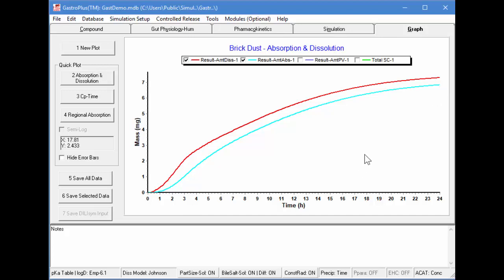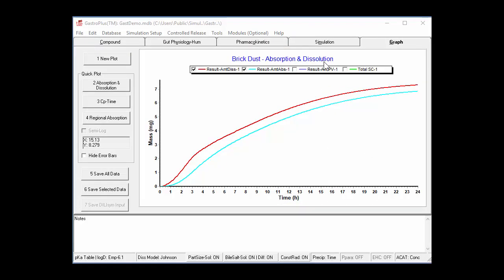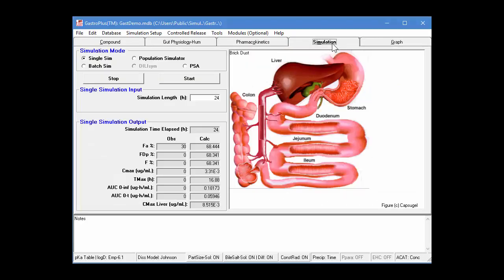So how can we use parameter sensitivity analysis to determine what is the most sensitive parameter to that fraction absorbed?